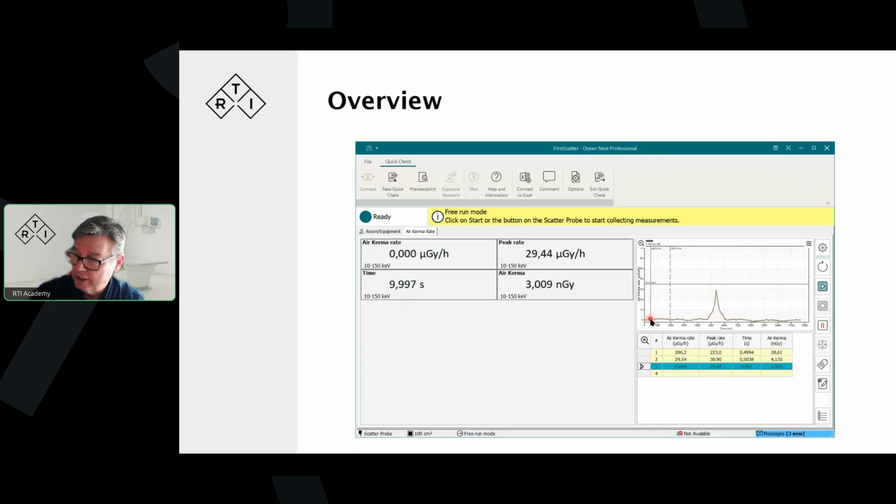So if I'm moving it slowly from the bottom of the door up, and here is the top of the door, I know that at the middle of the door, that's where I have a hotspot. That's why it's not the exposure time, it's the measurement time that we're seeing here. That's the time base. We start the measurement here, and here we press the capture button. Ticking also indicates that the measurement is now ongoing.